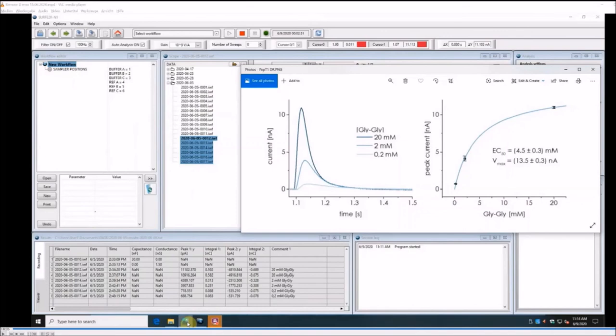This highly depends on how tight the proteoliposomal membrane is for the respective compound you want to get a gradient for. For example, if you want to get pH gradients, this is quite nicely doable because protons go through membranes on a minute time scale, so you can establish gradients on the fly easily. But if you have other ligands or larger molecules which won't go through the membrane, you need to prepare different sensors to adjust the internal composition of the proteoliposomes.